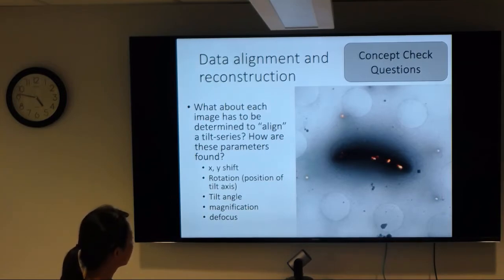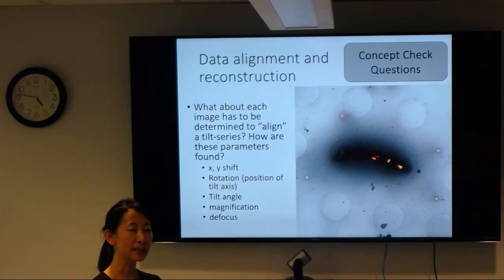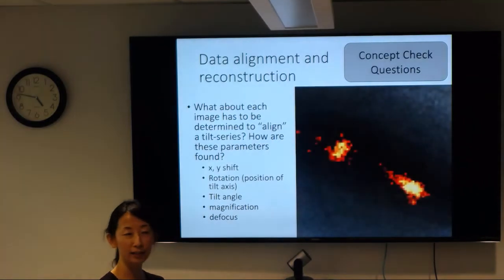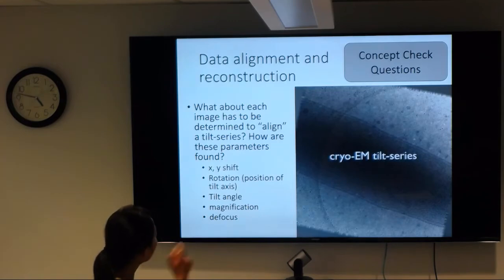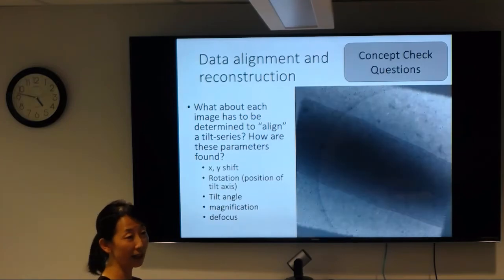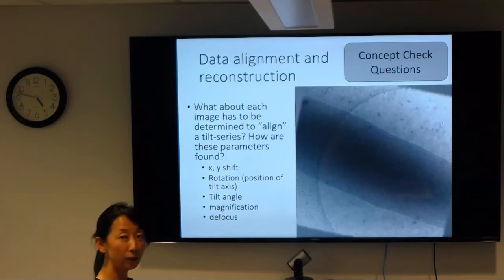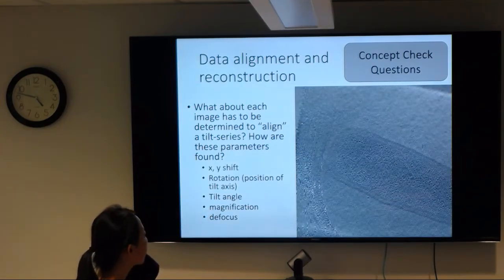But they have a very interesting idea in the paper. They say the cell can actually serve as a kind of buffer. So although the ice close to the outside of the cell is not that good anymore, the inside of the cell, in theory, is actually pretty okay. You can still see structural details. They're really good looking. See, when you zoom up and down.